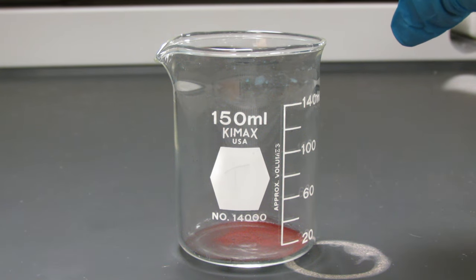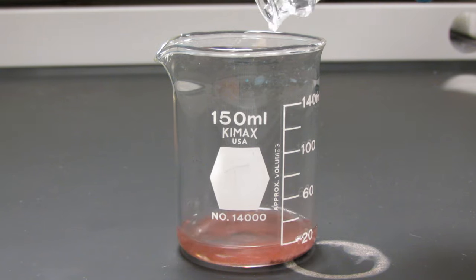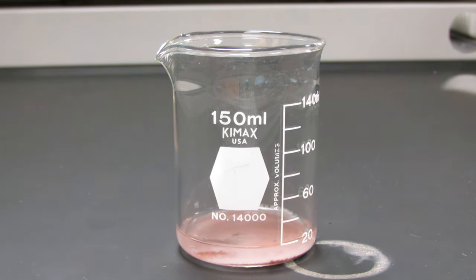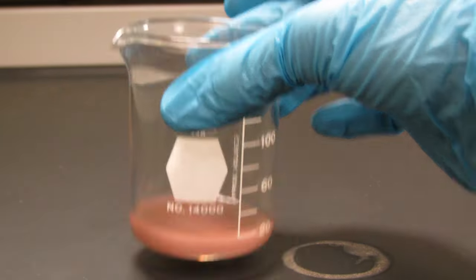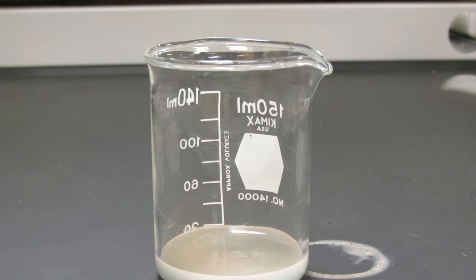Now add 10 milliliters of 6 molar nitric acid. This clip is sped up 4 times, and it takes a little bit for the copper metal to start reacting, but pretty soon the nitrogen dioxide gas begins to form as you can see.